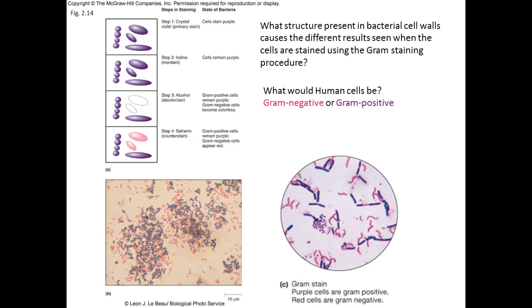In the past, some people have used acetone. Acetone is a really good decolorizer. Those of us that get our nails done, we know all about acetone. Right? It smells really bad and it is extremely damaging to mucous membranes. It's a very strong irritant, which is why we don't use it in the lab, why we prefer to use ethanol alcohol because it works just as good in this procedure as acetone does. Unfortunately, not the case when it comes to nail polish. They have alternatives out there. I don't know what they're even made of, but good old acetone is always the one that works best.